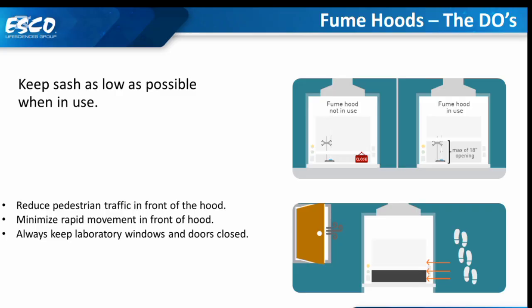Keep the sash as low as possible when using the fume hood, so don't open it too much. The lower the better. Reduce pedestrian traffic in front of the hood. Minimize rapid movement in front of the hood. Always keep laboratory windows and doors closed.